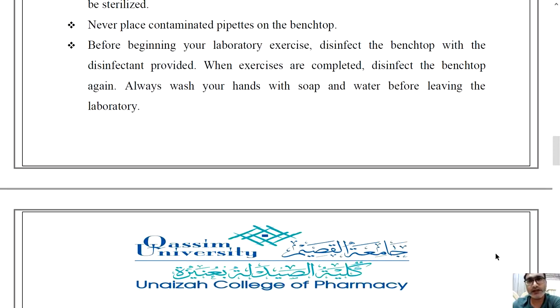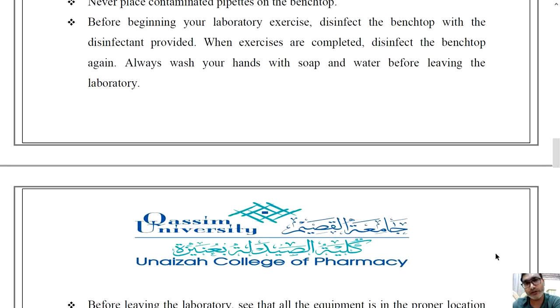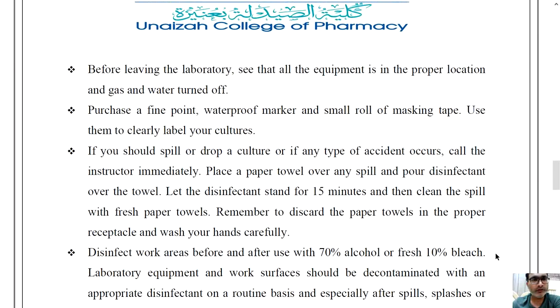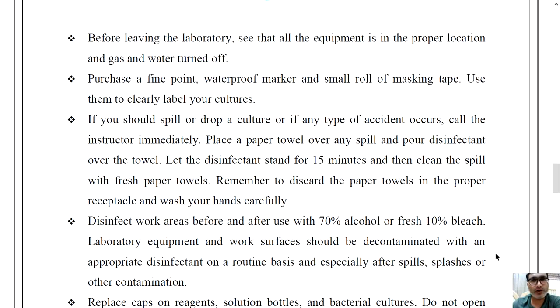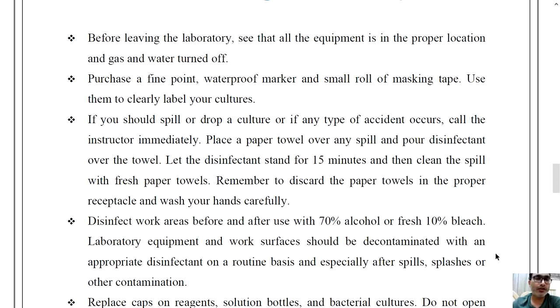Disinfect the bench top again after your work. Always wash your hands with soap and water before leaving the laboratory. Before leaving, make sure all equipment is in its proper location and that gas and water are turned off. It is your complete responsibility that no gas or water tap is left on.